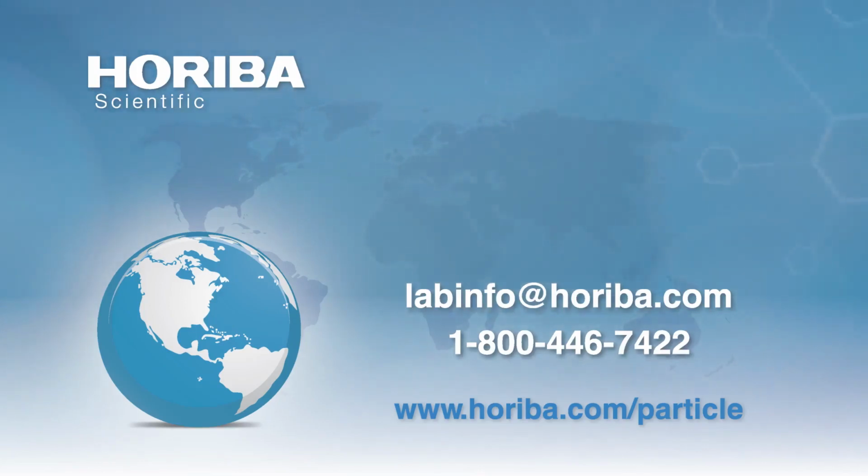And by the way, in formulation, it's not the 99% that you know about that kills you. It's the 1% that you forgot about or didn't measure or didn't even know about, because we're talking about interfacial chemistry here. And it's exactly that interface that controls it. It's not the bulk properties of it. It's what happens at the interface. And that's why it's important to do proper full physical characterization.